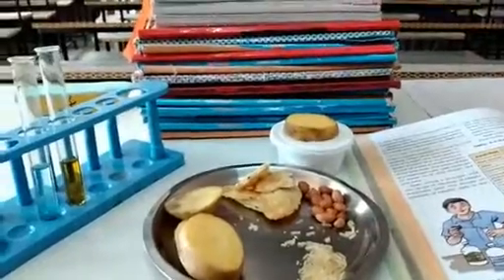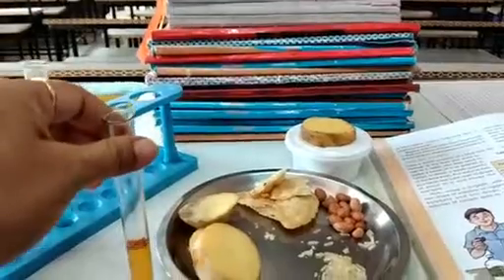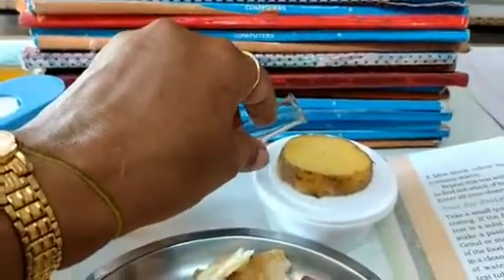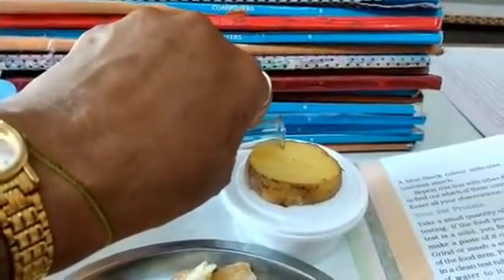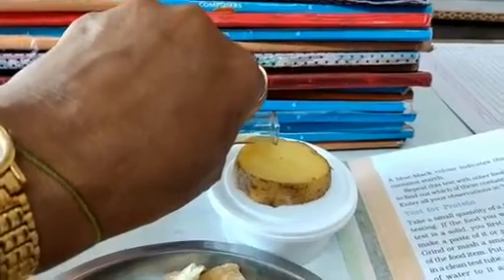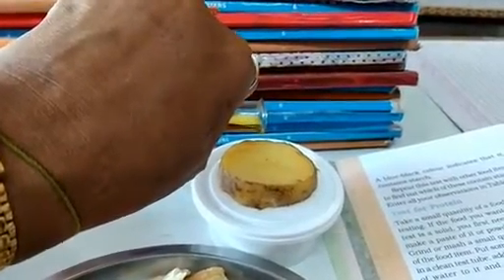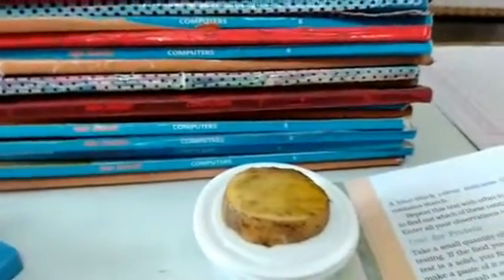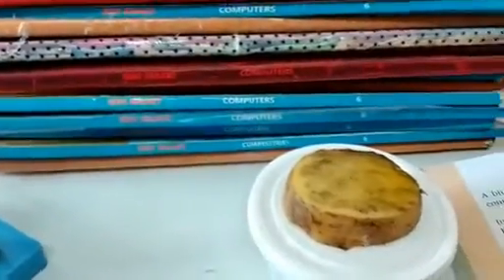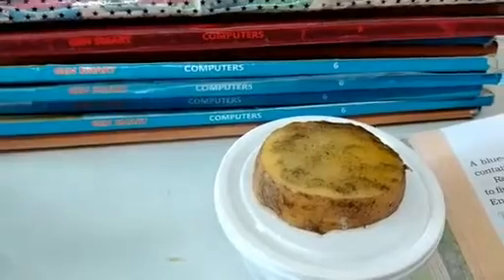Now first we'll start with the starch test. I'll take iodine solution. You can see I have kept a potato slice on a box. I'll drop a few drops of iodine solution on the potato slice, and can you see the dark blue stain on it?